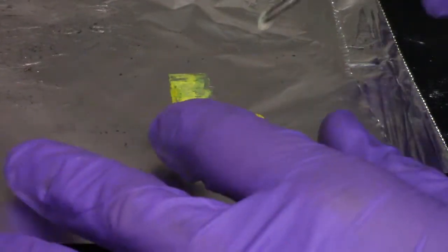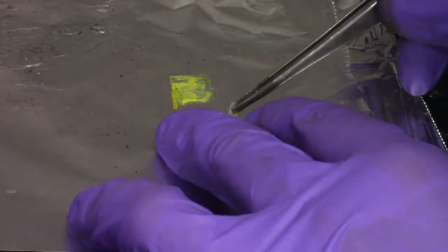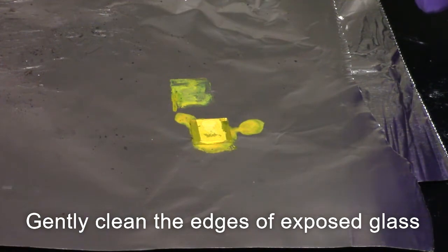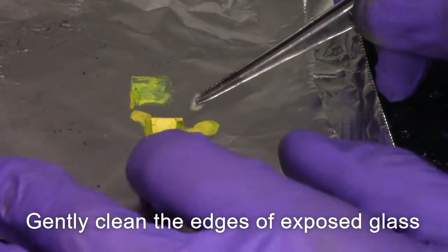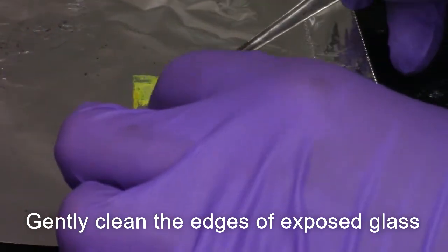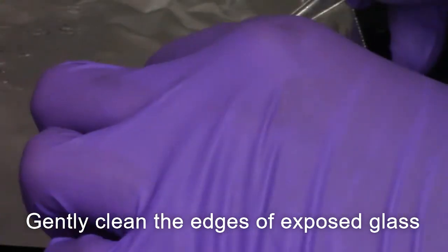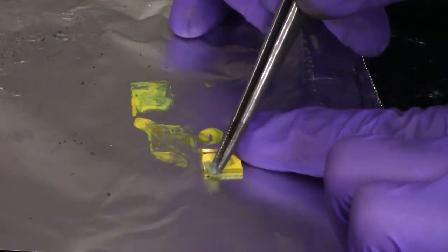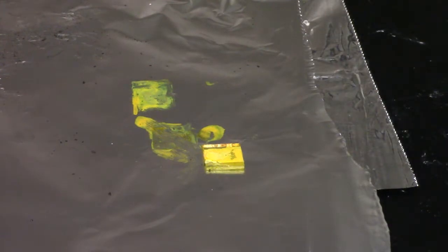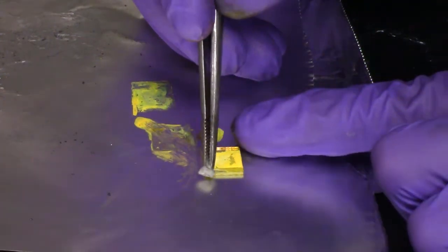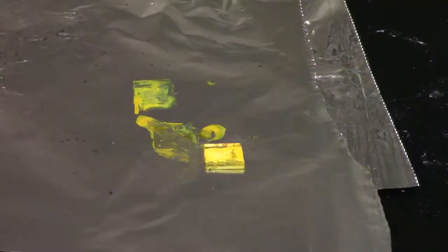After the dye has dried on the TiO2, take a very small amount of tissue paper and gently saturate it in ethanol. Carefully wipe the edges of the exposed glass with excess dye. This will allow proper measurements when the full cell is constructed. When completing this step, take special care not to disturb the TiO2 surface.